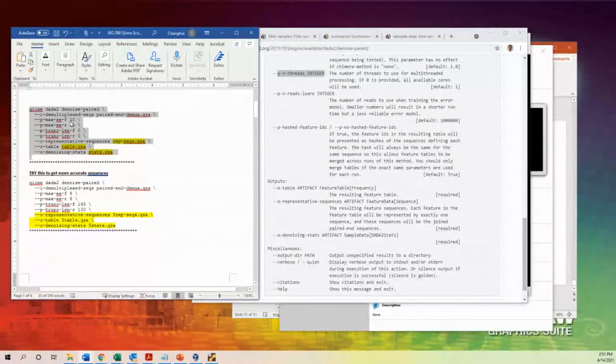And when you change to 5, make sure you change the different file name here. Otherwise, they will override your data. So you can, for example, change to 5. You can put 5 here, and then 5 here, and 5. So that you can distinguish the difference, and also you will not override your data. Okay, thank you so much.